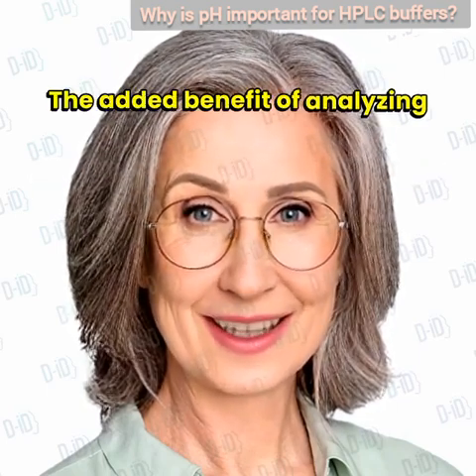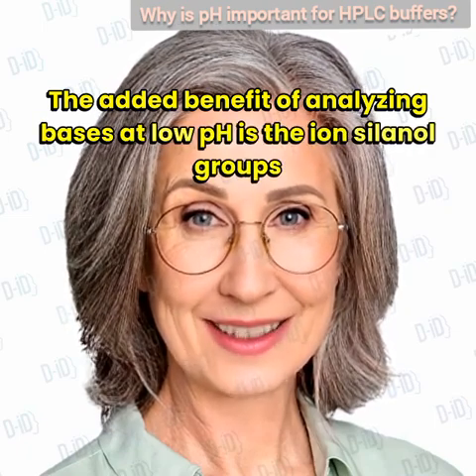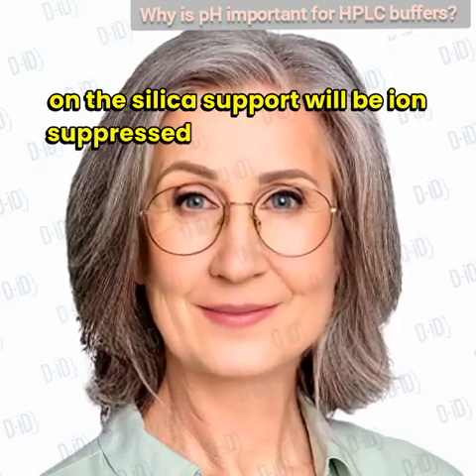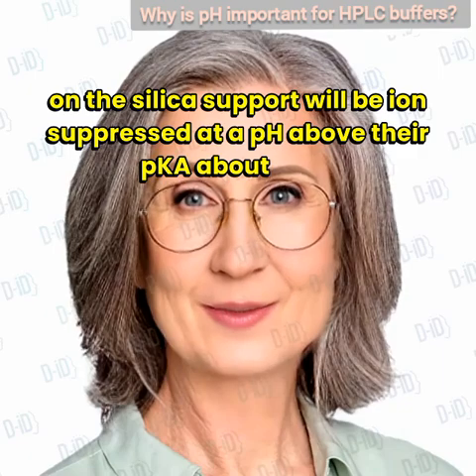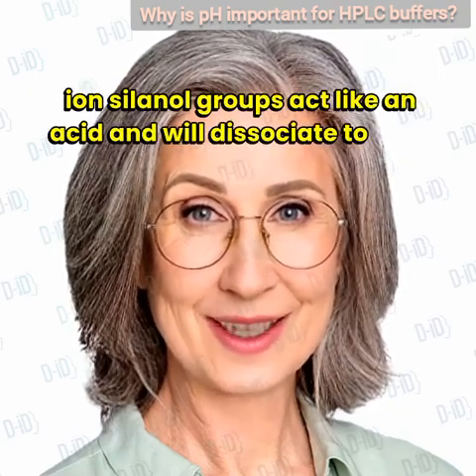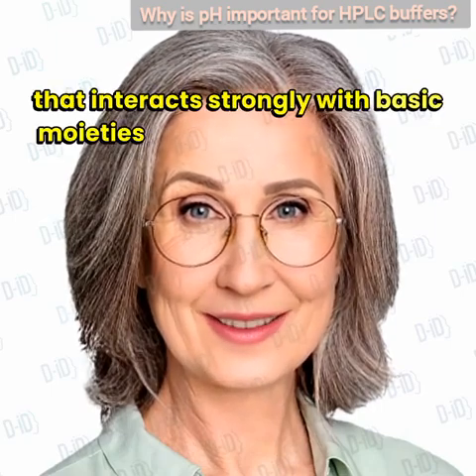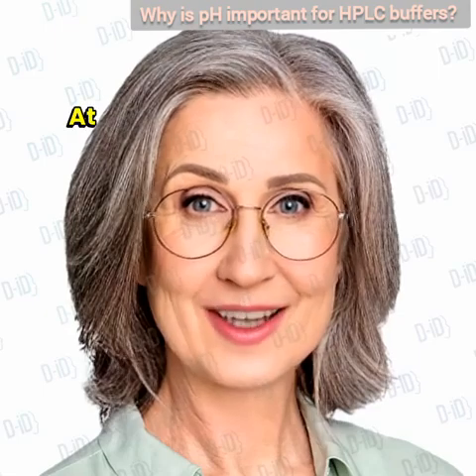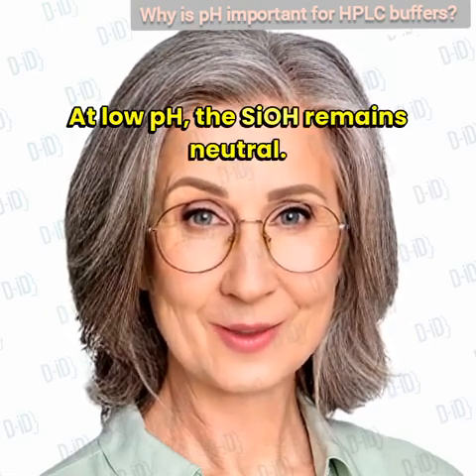The added benefit of analyzing bases at low pH is that the silanol groups, SiOH, on the silica support will be ion suppressed. At a pH above their pKa, about pH 4, silanol groups act like an acid and will dissociate to give ionized SiO that interacts strongly with basic moieties and results in bad peak tailing. At low pH, the SiOH remains neutral.